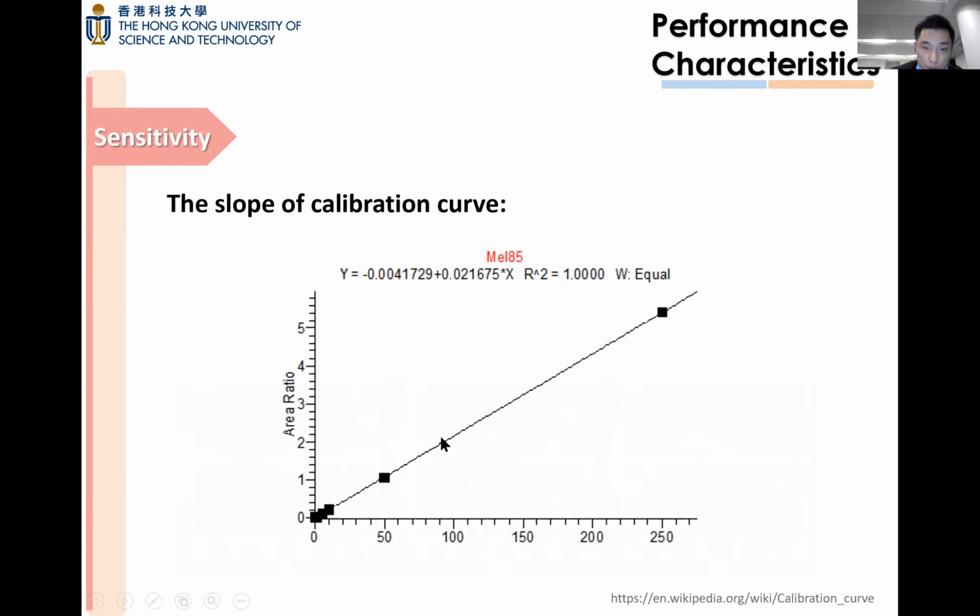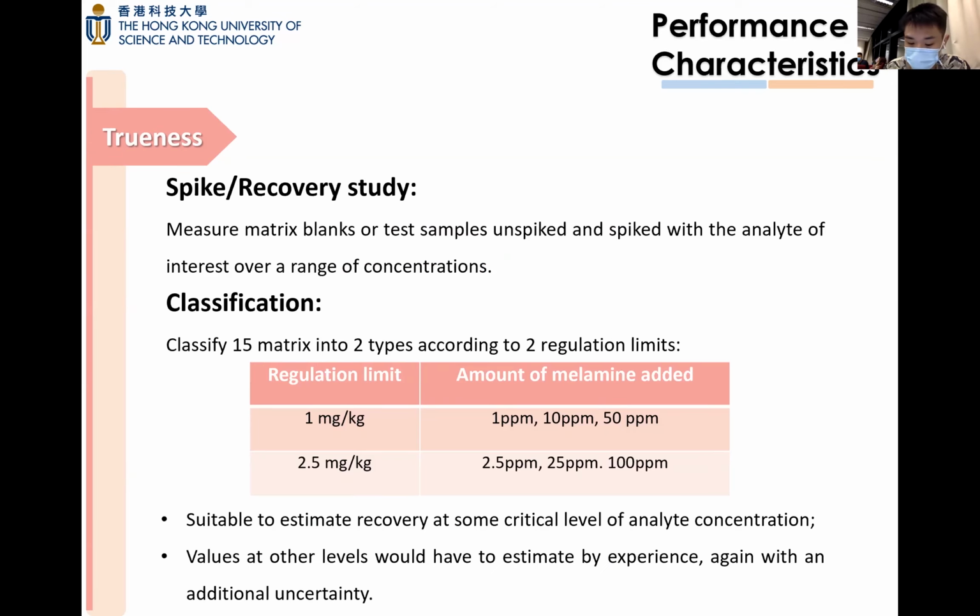And this picture shows the calibration curve and the R value. And finally, my part is the sensitivity, which is the slope of the calibration curve. That's all. Thank you.